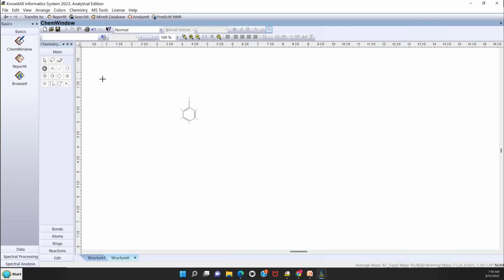But this time, instead of using a hotkey, I want to add aluminum. To do that, if you hover over the little thing that looks like oxygens with bonds on either side, that's the label tool. If you click on it, you'll see a little flashing bar, and that's where we can insert our user-defined elements. So I'll hold down the Shift key this time to get just a capital A. It means something different here. It's not trying to put in a hotkey atom.